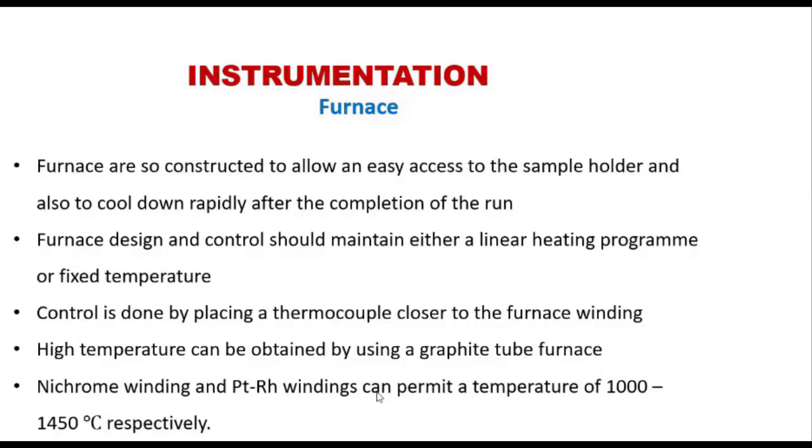The control is done by placing a thermocouple close to the furnace winding. So if the furnace is heated by coils of wire, the thermocouple for the temperature of the furnace is kept near the winding.